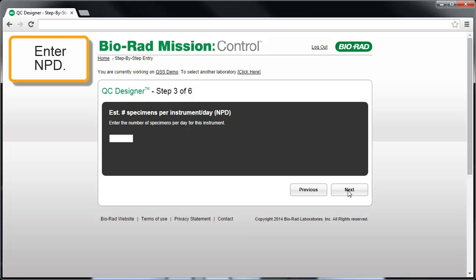In Step 3 of 6, enter the number of patient specimens per day that are examined on the selected instrument. The number of patient specimens will vary from day to day, so enter the approximate average number of patient specimens examined per day.